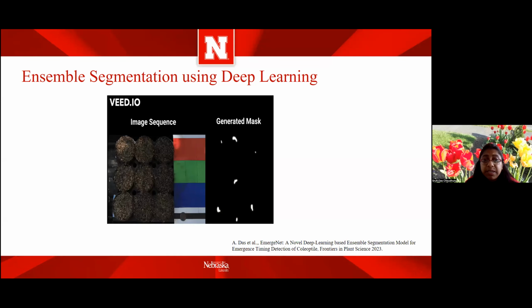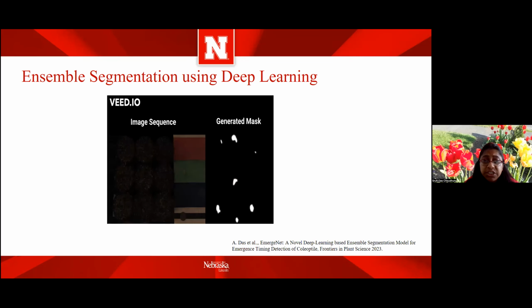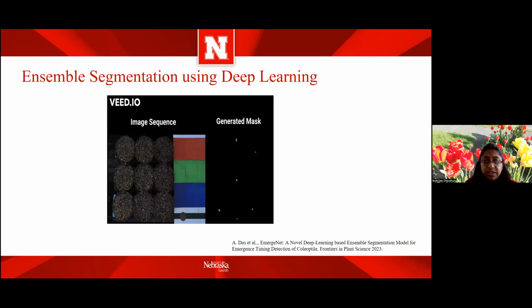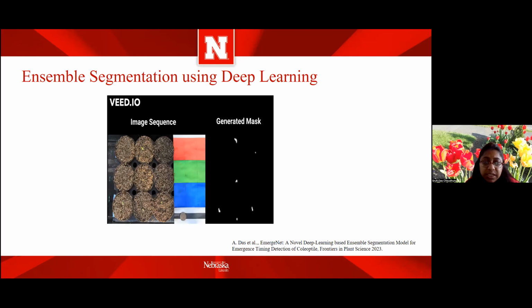It's because they are so tiny, because the illumination variation is havoc, because the images are taken at 2-minute intervals, days and nights. So extreme contrast in illumination variation. Moreover, since these are germination pots, we have used some colored stone materials. Plant scientists will know the names very well. That adds challenges and makes the background even more cluttered.